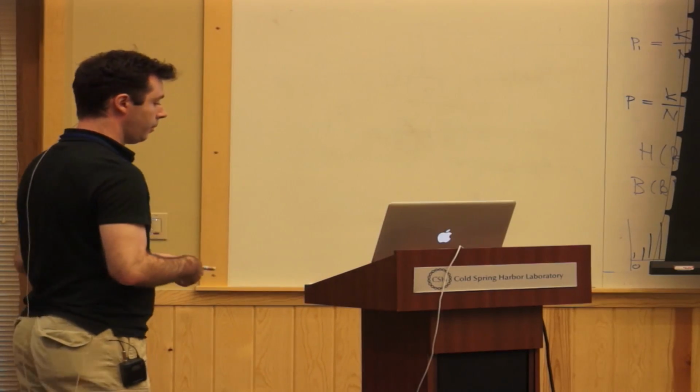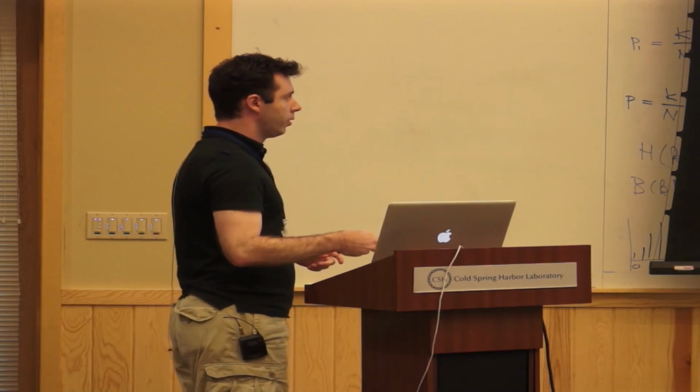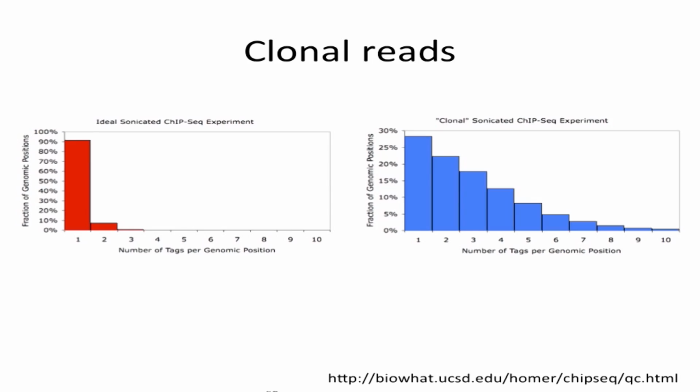I do want to mention that these are analyses that you can do in R, but there are also tools like Homer that do a pretty nice job producing these figures for you. It's not an R package, but it's a very nice set of tools that you can use to create some of these plots.